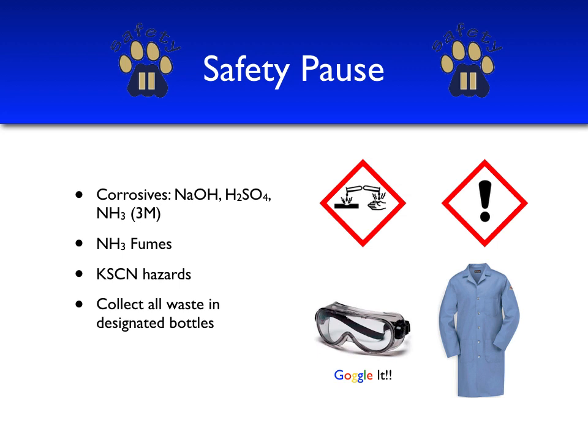Aside from being an environmental hazard, KSCN, potassium thiocyanate, can combine with certain oxidizers to produce a gaseous product that has an unfavorable odor. All chemical waste for this experiment will be collected in a designated waste bottle. And of course, we'll remember to wear our personal protective equipment, our safety goggles, and a flame-resistant lab coat.